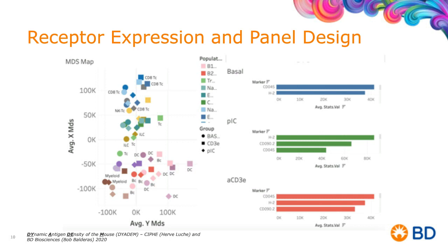This is a live database, though, and I think it will be available out there so that individuals can just look in there and see what those expression profiles may be on multiple different subsets of cells. So there's tools out there and data that help us know what's on what cell and how much has been expressed.